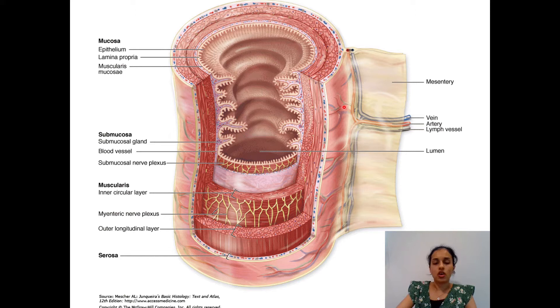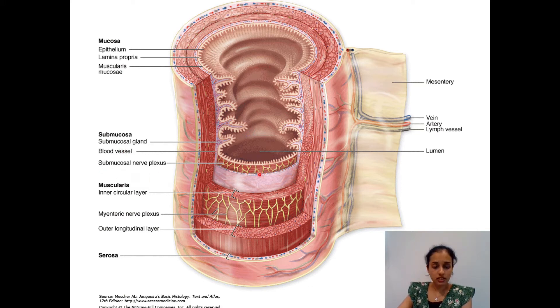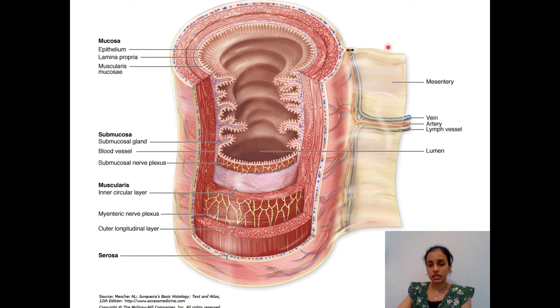This picture shows all four layers with their sub-layers: mucosa with epithelium, lamina propria, and muscularis mucosa; submucosa with submucosal glands, blood vessels, and Meissner's nerve plexus; muscularis externa with inner circular and outer longitudinal layers and myenteric nerve plexus between them; and the outermost serosa — since this section is from small intestine enclosed by mesentery — showing connective tissue with mesothelium.